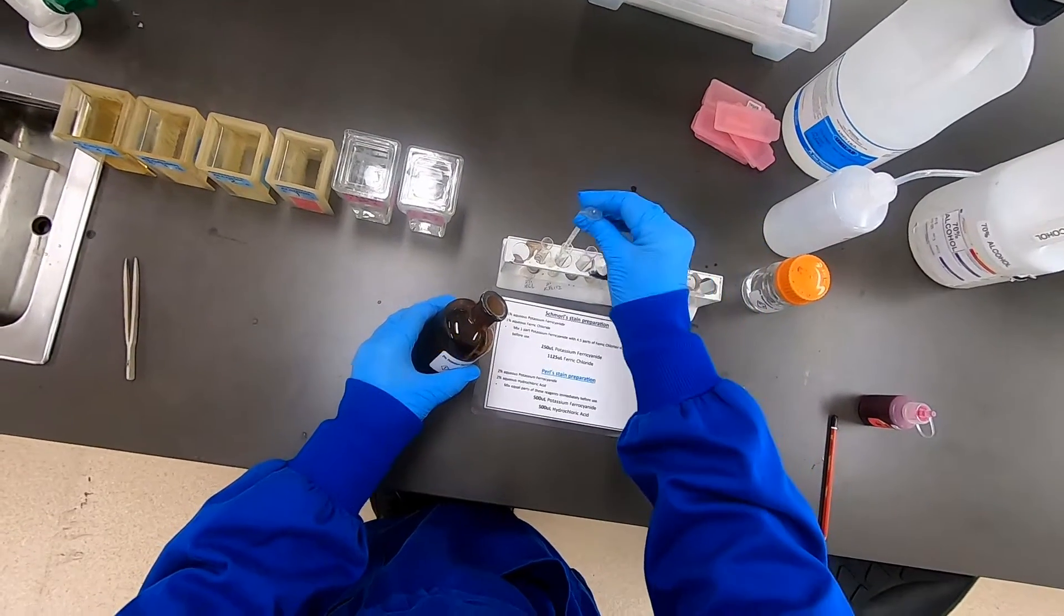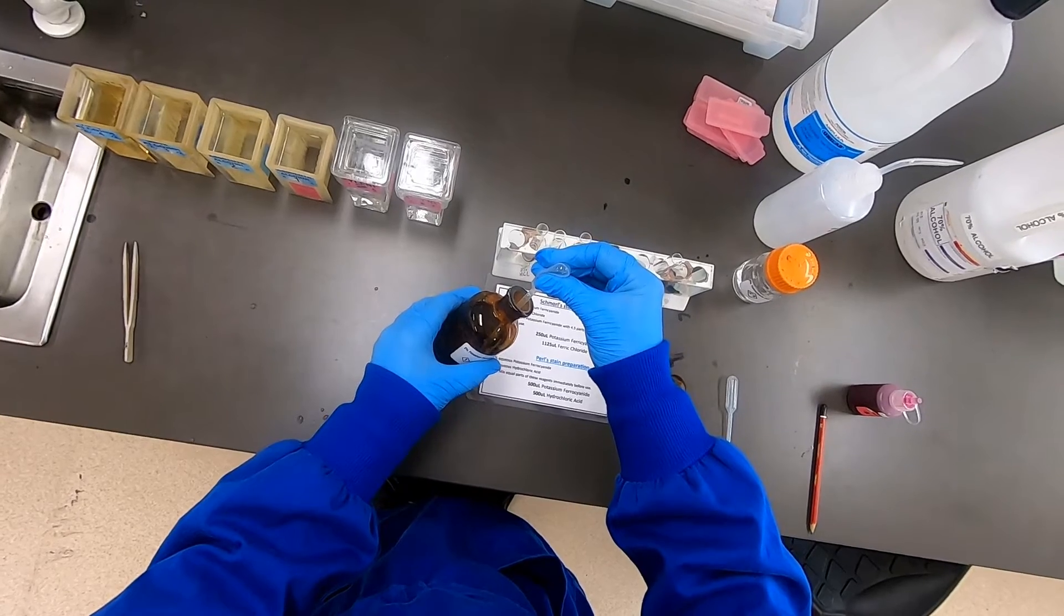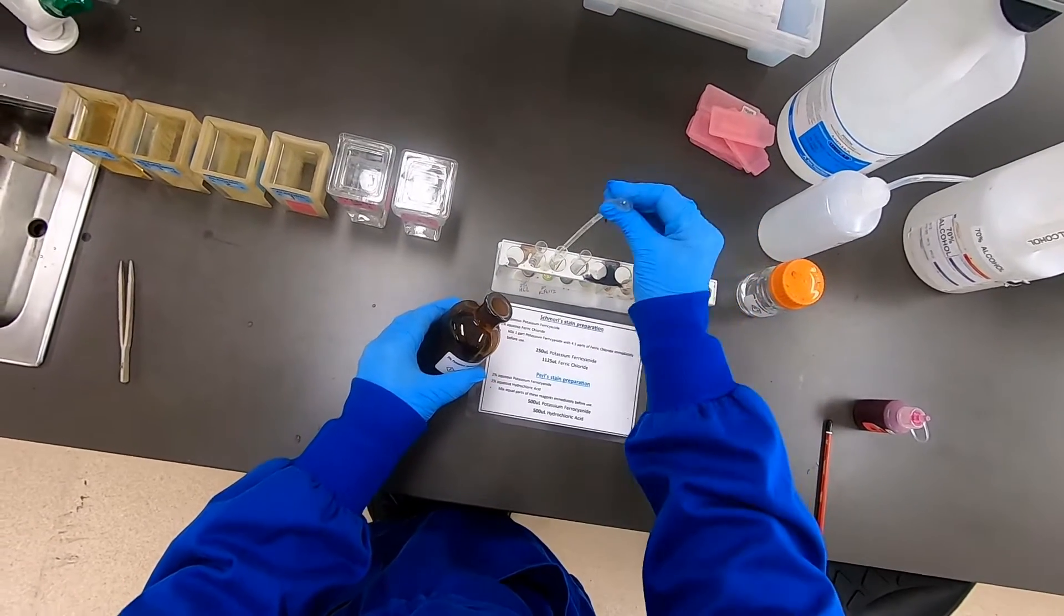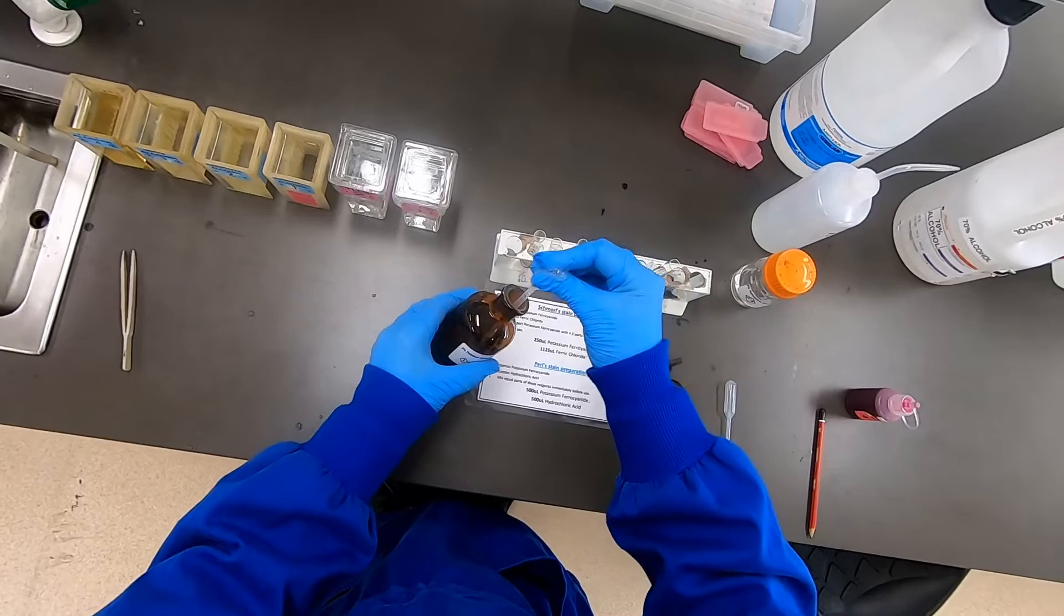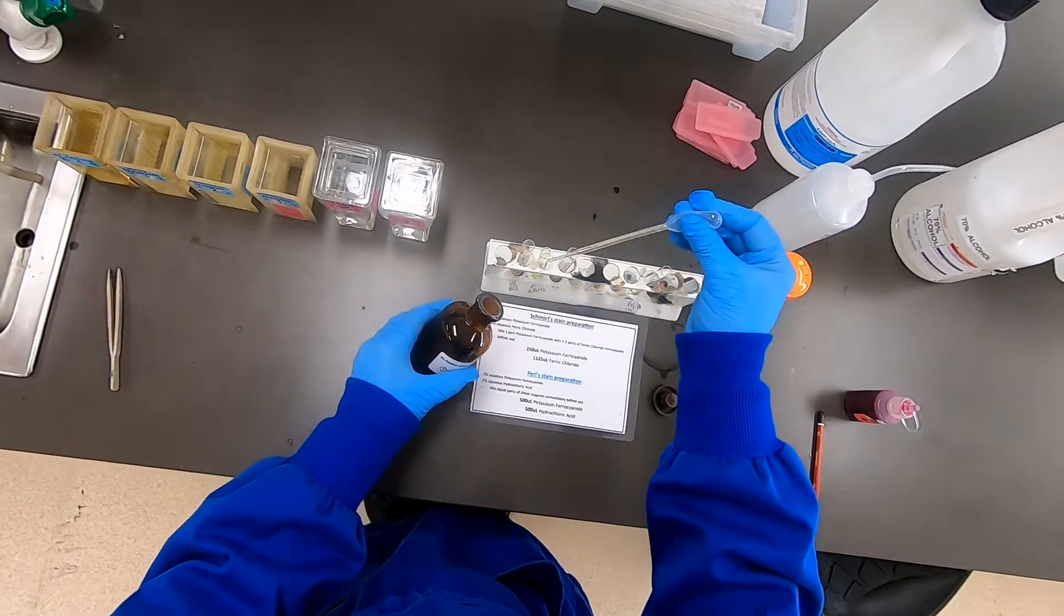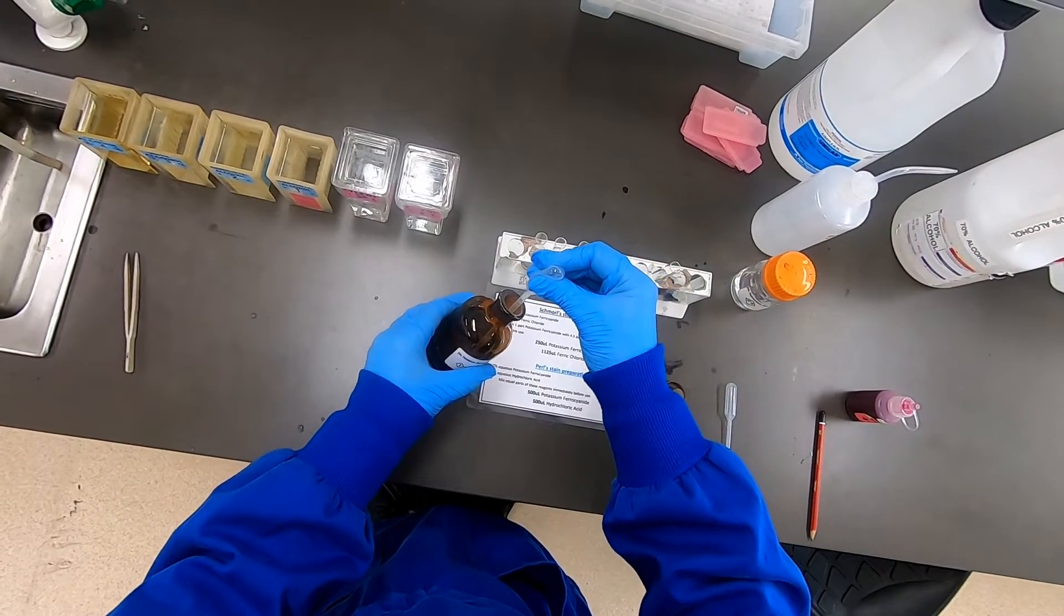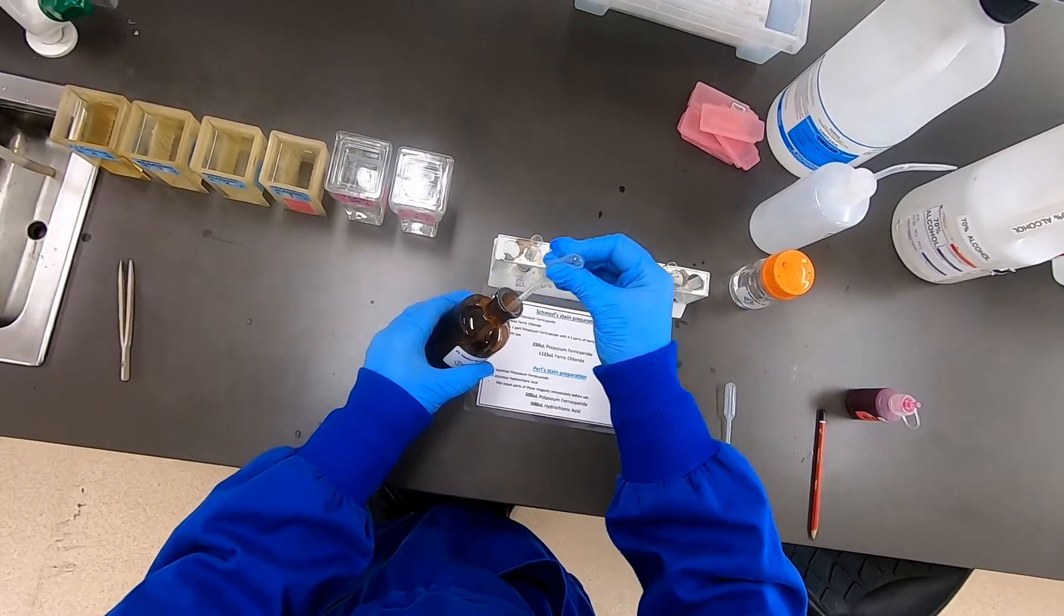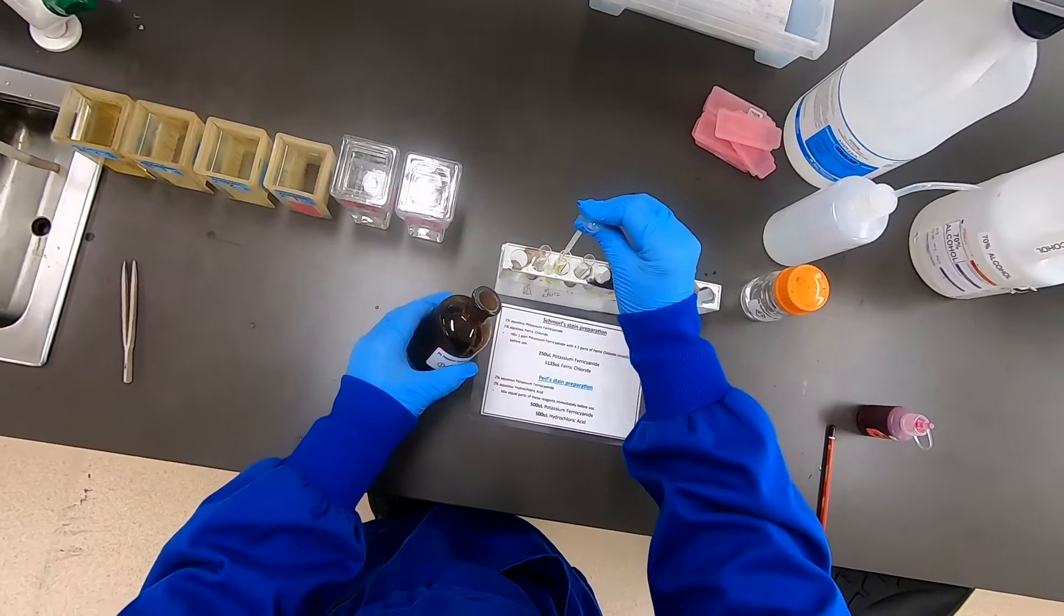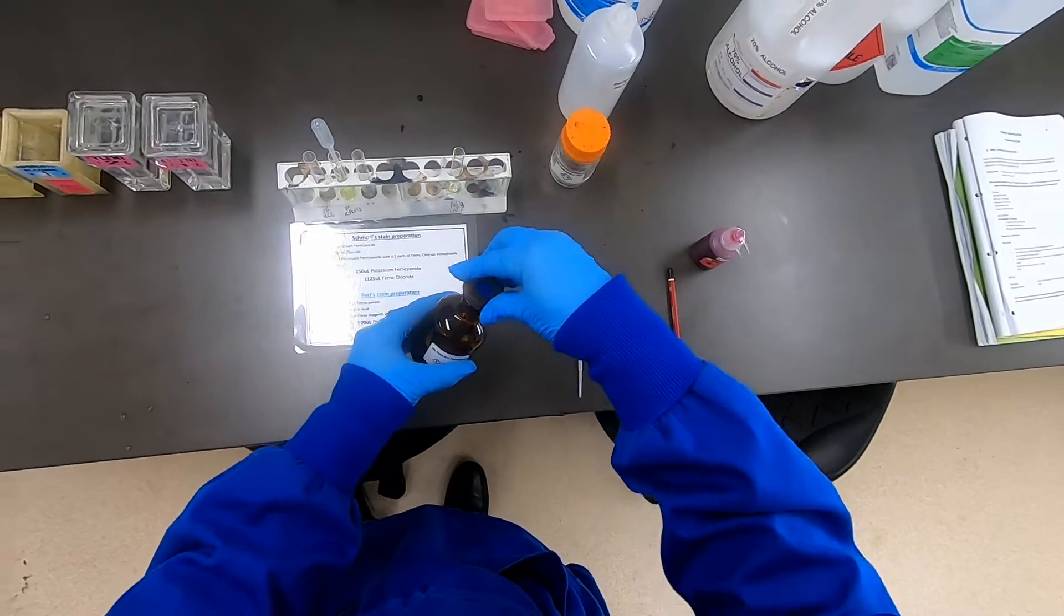Carefully measure out using these transfer pipettes. You can get a reasonably good measure of 1 mL at a time with the markings on these pipettes. So 4 mL of the potassium ferrocyanide.